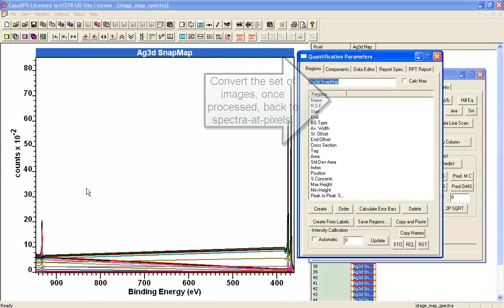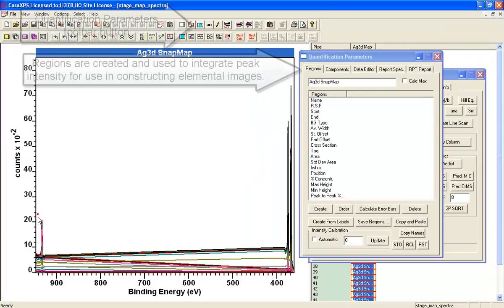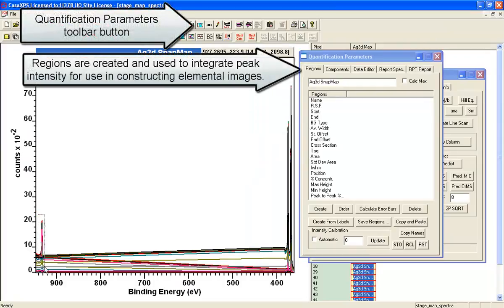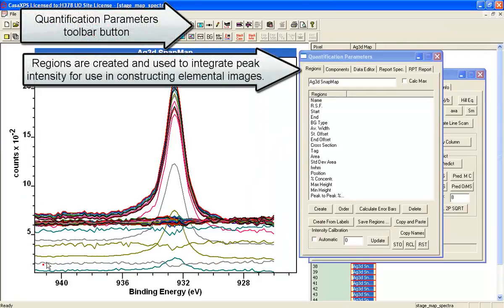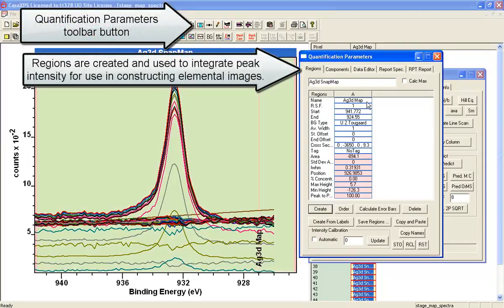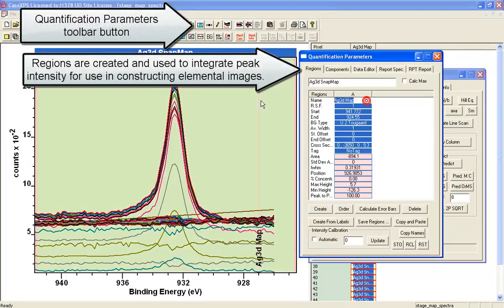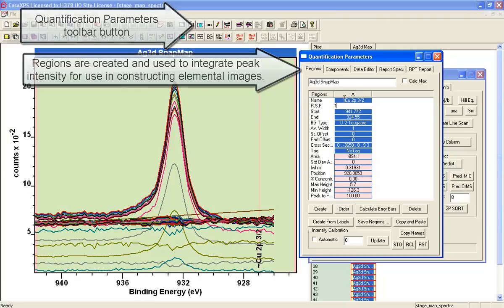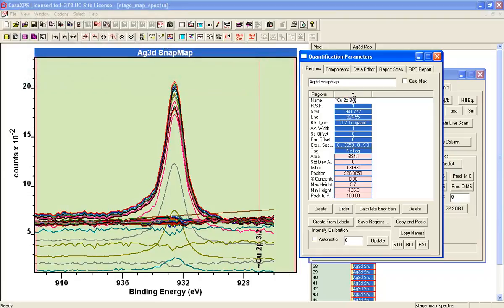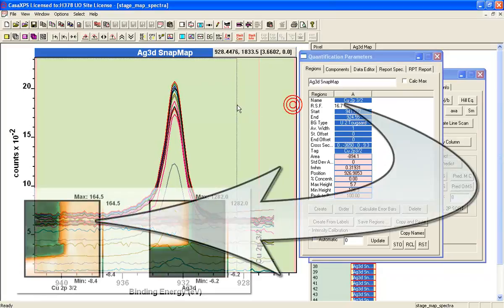We can create a pair of regions, and this one will be the copper 2P three halves.